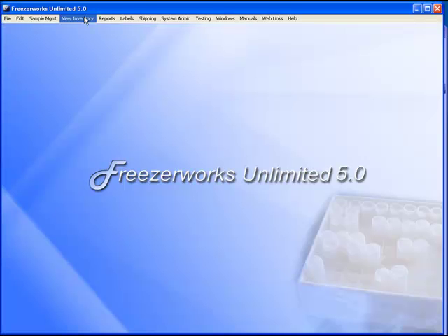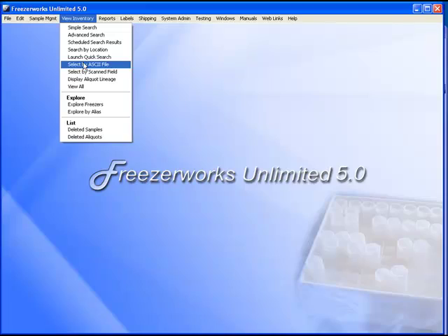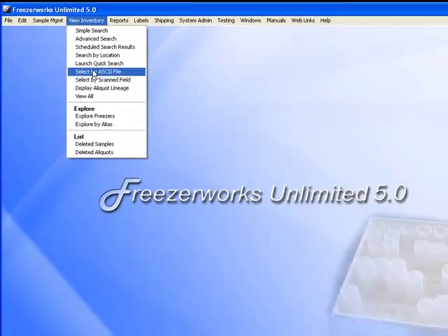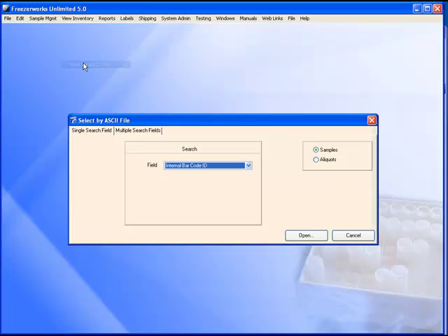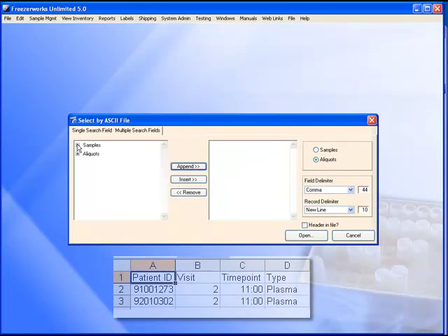What could take hours will instead take a minute using FreezeWorks. In this case, we want the Select by ASCII File option. We set our search for aliquots and then select the fields in Dr. Barton's criteria.